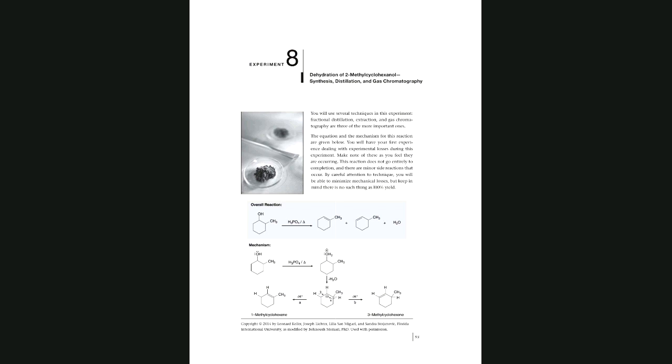Now, take the flask out in order to add my chemicals. I have everything ready. So when I bring my chemicals, it's to be quickly closed. Everything needs to be closed.